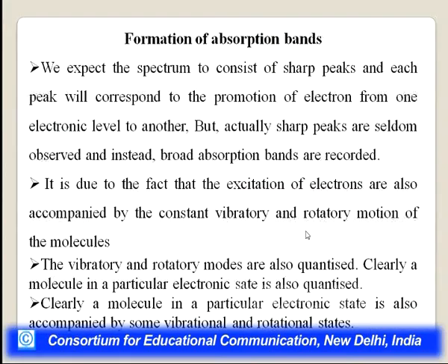But actually sharp peaks are seldom observed. We observe broad absorption bands. It is due to the fact that excitation of electrons is also accompanied by constant vibratory and rotatory motion of the molecules. The vibratory and rotatory modes are also quantized. Clearly, a molecule in a particular electronic state is also quantized.